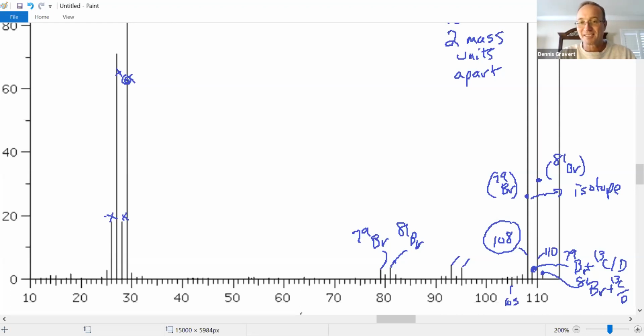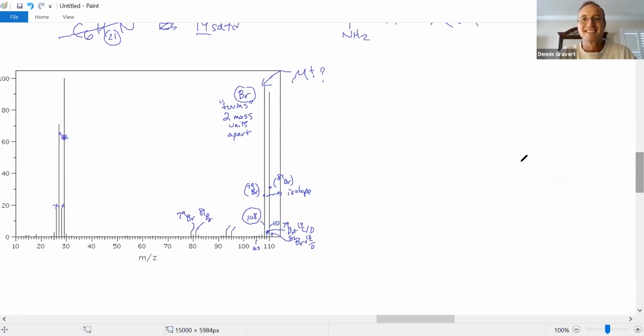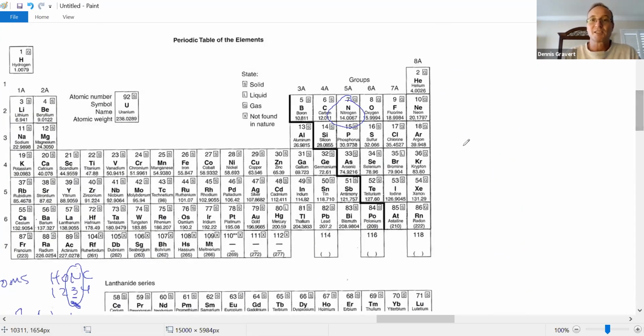Okay, I don't like the resolution. It's all pixelated. Step one was find the mass number. It's 108. We got a bromine. Use the most common isotope. Periodic table, where'd you go? Go to the mass of bromine. It's 79.9. I guess this one you have to remember. You round it off to 80, you have the wrong value.